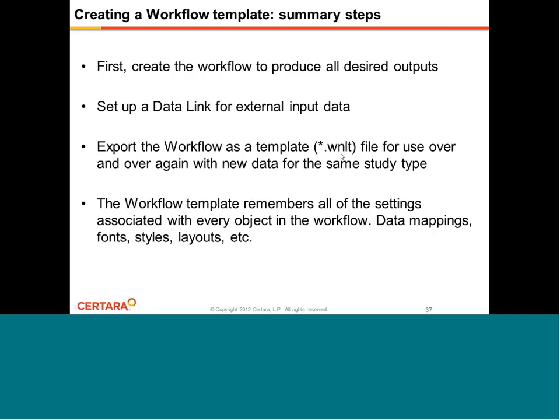This file has the extension WNLT and can be used over and over again with new data for the same study type. The workflow template remembers all the settings associated with every object in the workflow: all of the data mappings, fonts and styles of plots and tables, layouts, and so on.